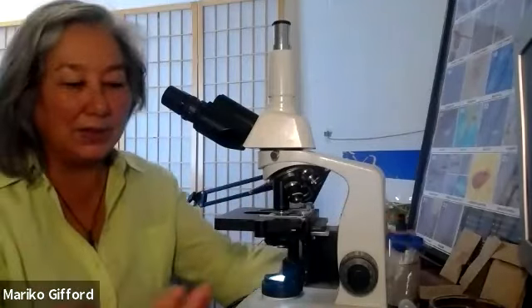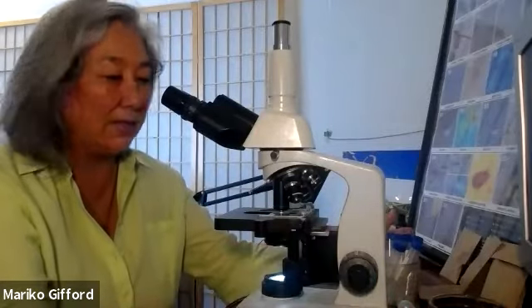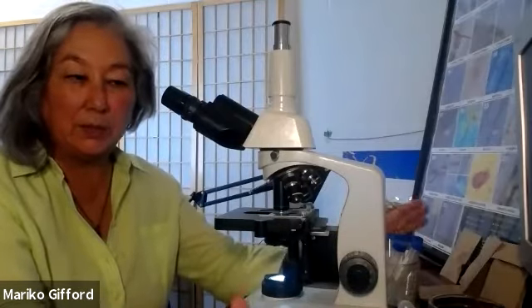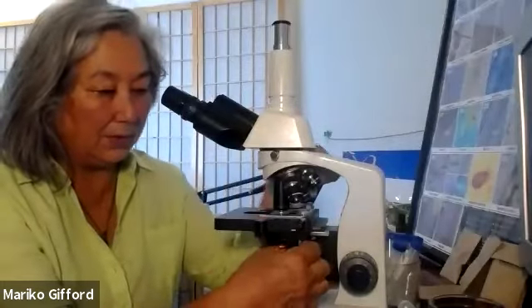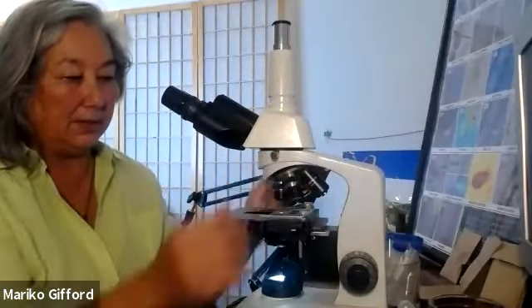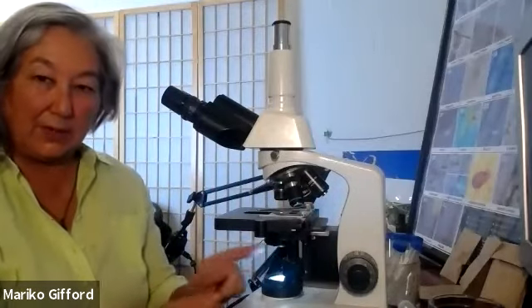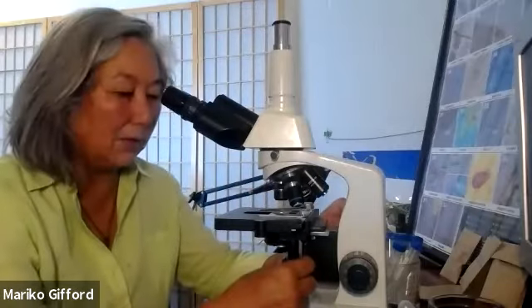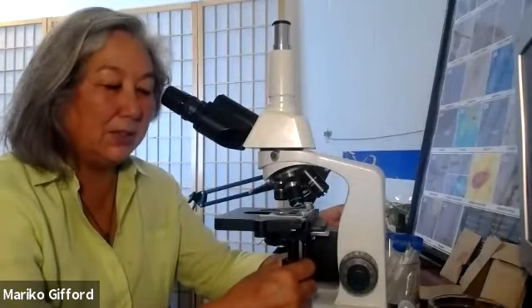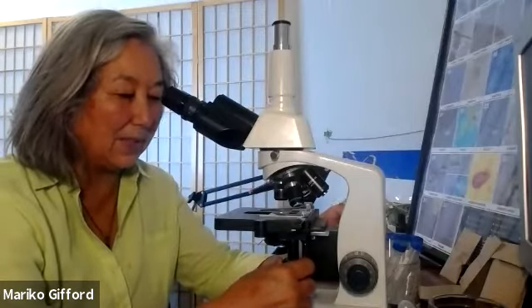But I have all my supplies right here. I have my water for rinsing. I have my slides and my slide covers. All of this is right here available to what I'm doing. And so when I'm looking at that, first you start with the smallest lens, and you're adjusting the diaphragm, and there's a lot of adjustments, and you get used to it over time. But it's just an amazing experience, and I highly recommend it. I love it. I just love seeing what's in there.